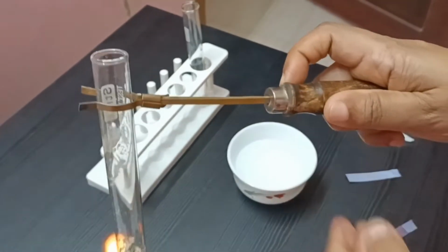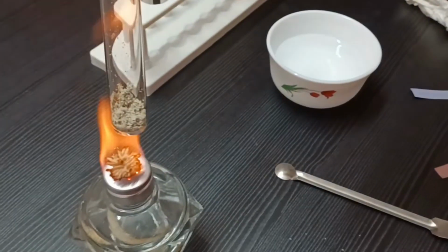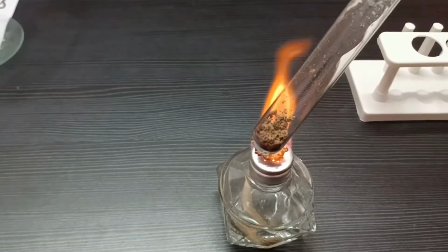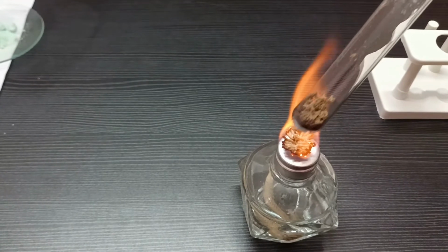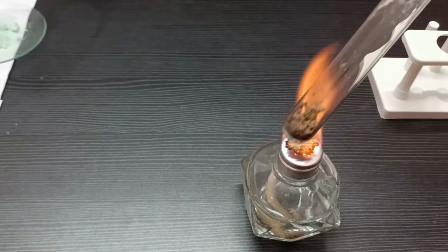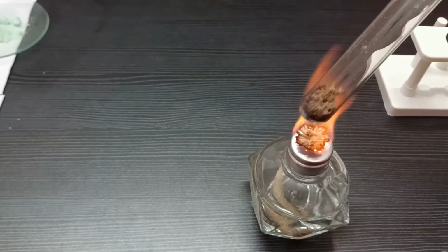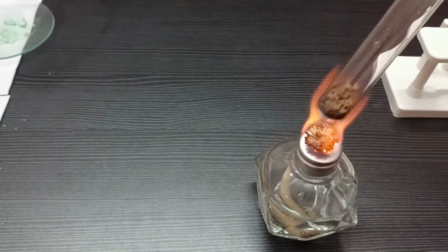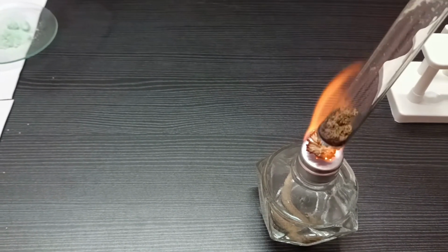Now we can continue heating. As we continue heating, we can see the anhydrous ferrous sulphate changing into a reddish brown colored substance. It is ferric oxide. This is one of the solid products formed during the decomposition of ferrous sulphate.